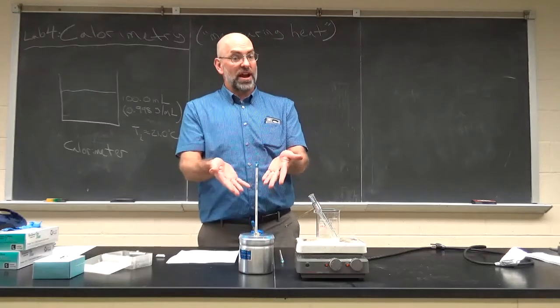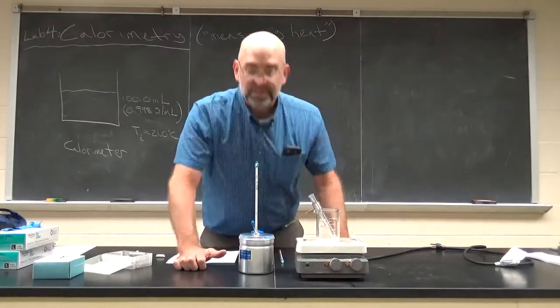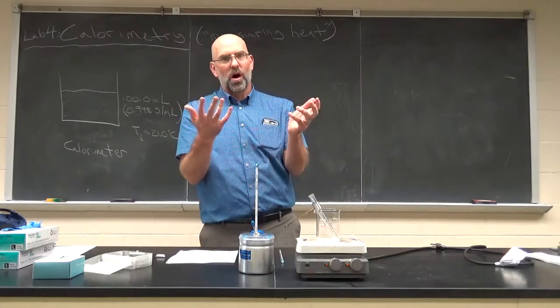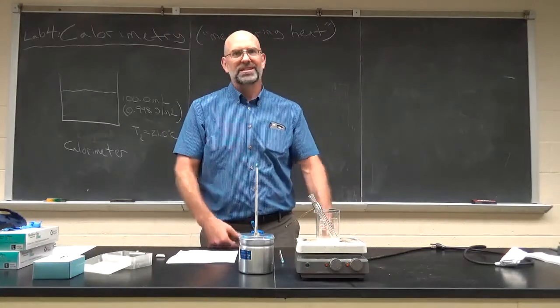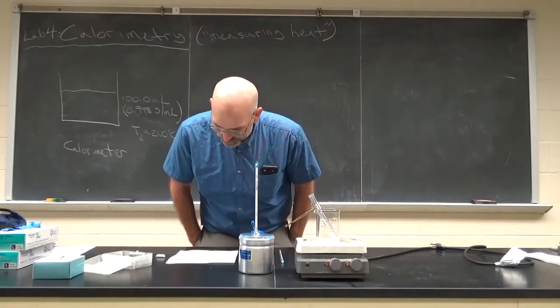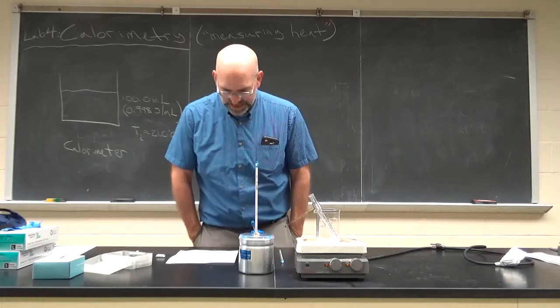Okay, some sources of error. The aluminum is sitting on the bottom of this container. So some of the heat is not going into the water, it's going into the aluminum container. That's a source of error. Okay. So that was step 10.